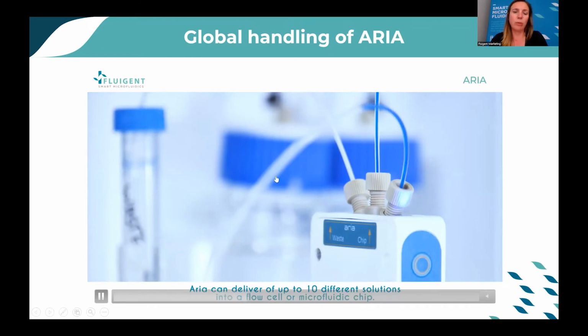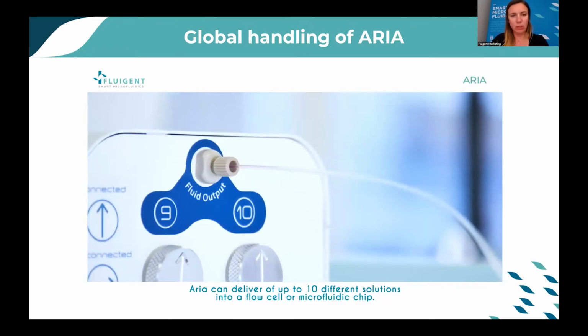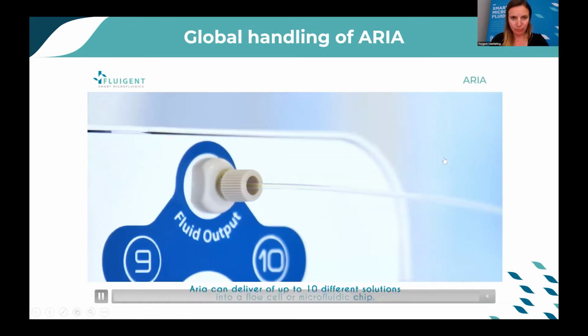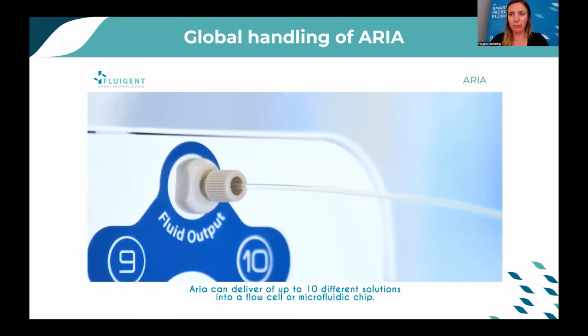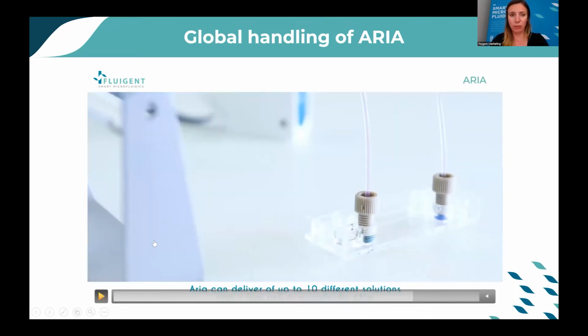Here you see with the dye, the liquid going through the fluidic line into the chip and coming out. You can inject sequentially several solutions. Here it's dyed again to illustrate the procedure, but everything is really automated. You can also choose to flush your tubing in between 2 solutions to avoid mixing between them.